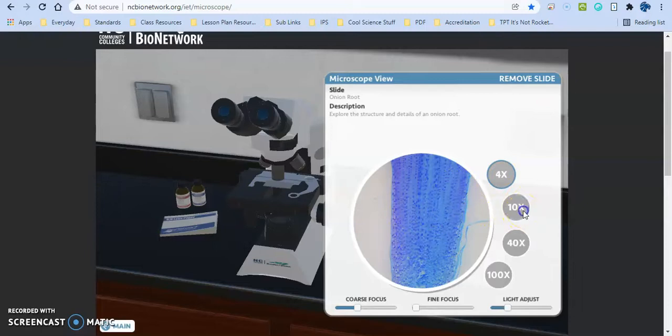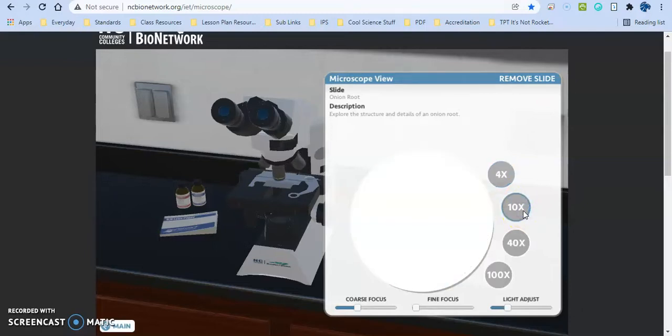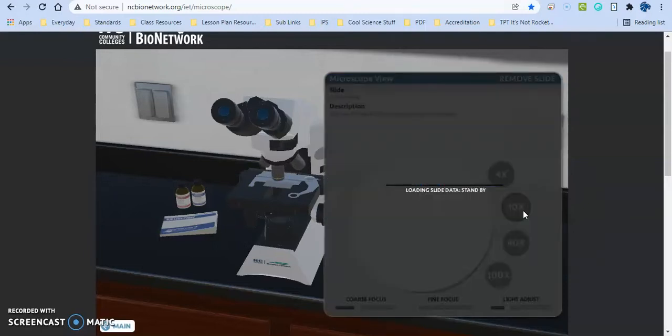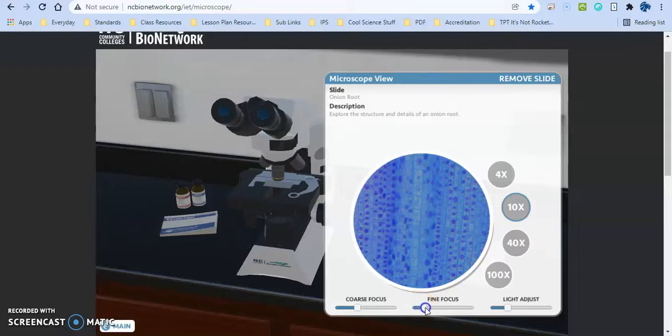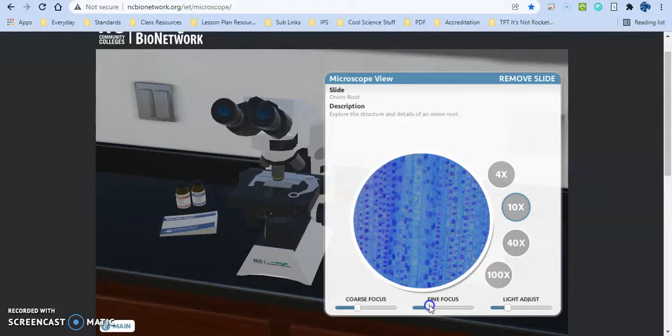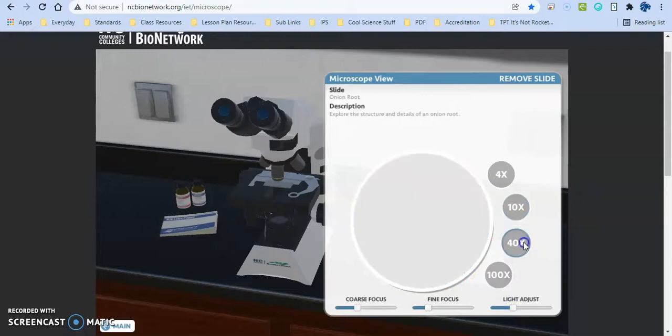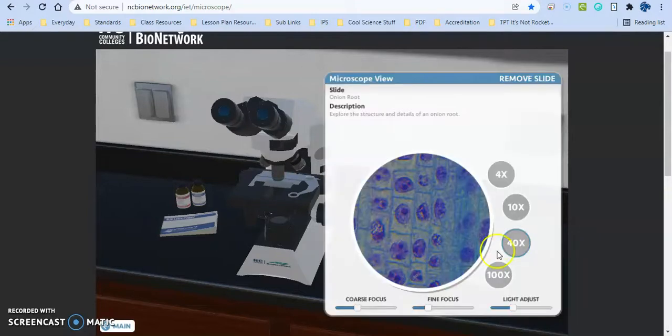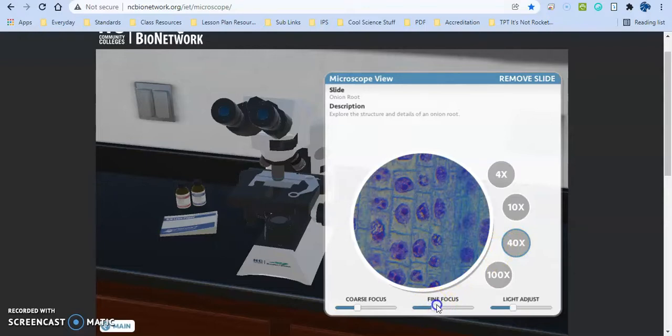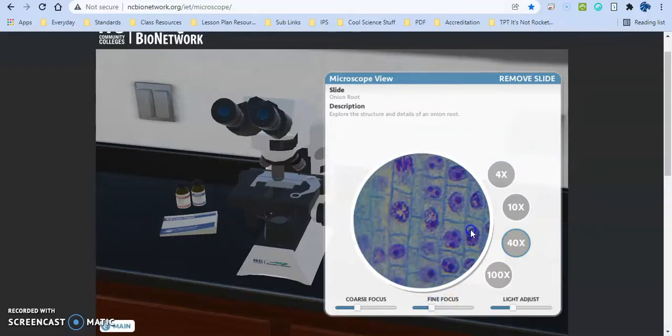Then you're going to go ahead and jump up to 10x. And really, at this point, you should only be focusing with your fine focus. So it does a good job of explaining that to them when they go through the tutorial. You get that as clear as you possibly can. Maybe increase the light as you get to a higher objective or maybe it needs to go lower. Jumping up to our high objective at 40x stays pretty true. I believe these are actual images from a microscope, so it's really good visual for them.